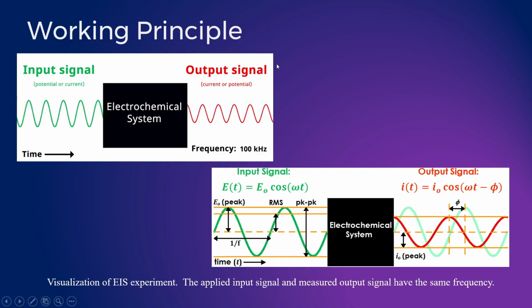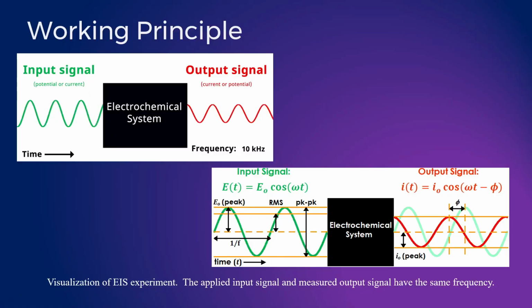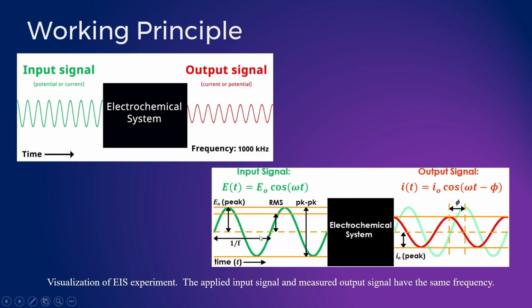Here in this picture you can see how frequency is varying throughout the time to probe the different electrochemical processes that are undergoing in an electrochemical system. And this is an overall calculation of the pictures of the electrochemical system.